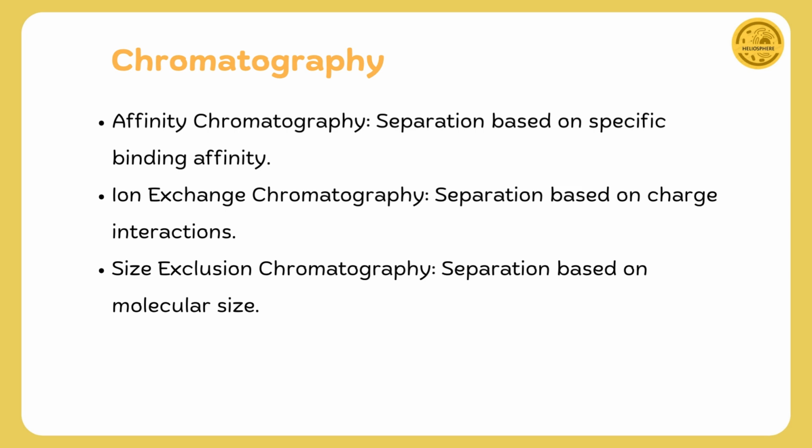Now, let's talk about chromatography. This versatile technique separates proteins based on their different properties. We will look at three common types: affinity chromatography, ion exchange chromatography, and size exclusion chromatography.